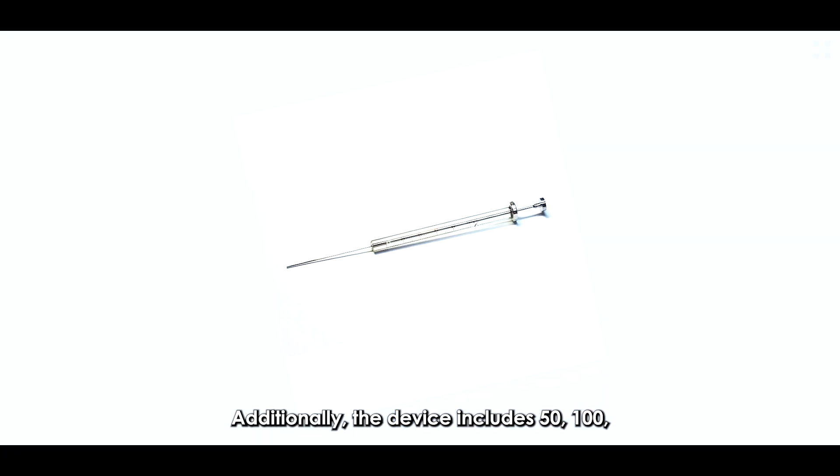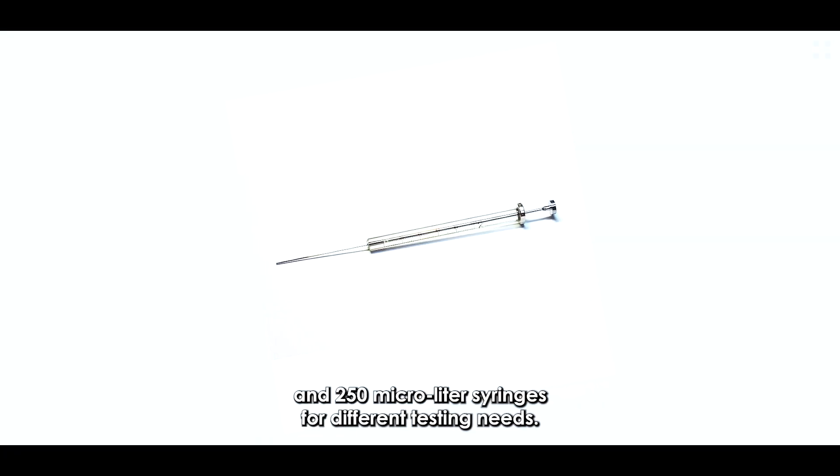Additionally, the device includes 50, 100, and 250 µL syringes for different testing needs.